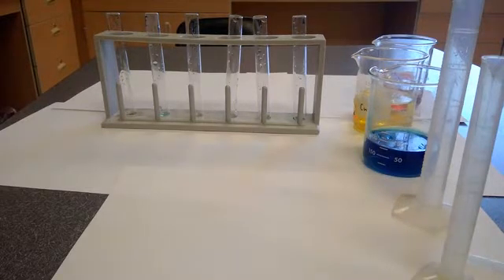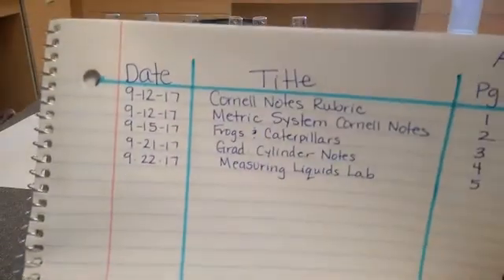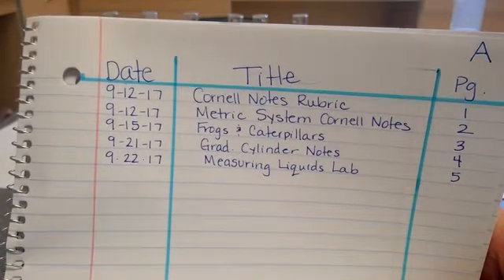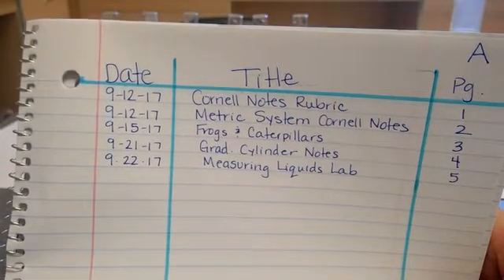Today we're going to be participating in a lab titled Measuring Liquid Volume with a Graduated Cylinder. Go ahead and in your science book, you're going to start by filling out your title page. So here's a look at my title page. We completed this lab on Friday, September 22nd, Measuring Liquids Lab, and it's going to go on page number 5.